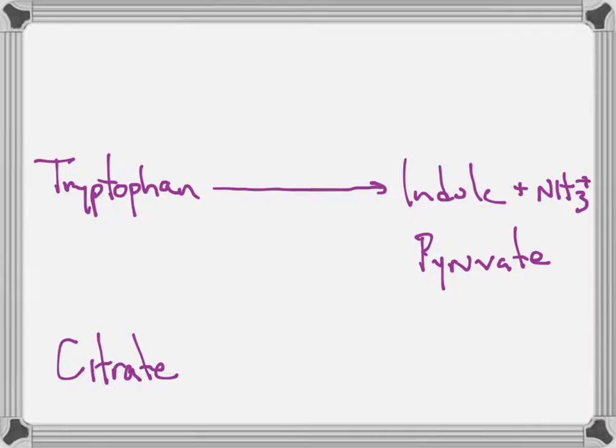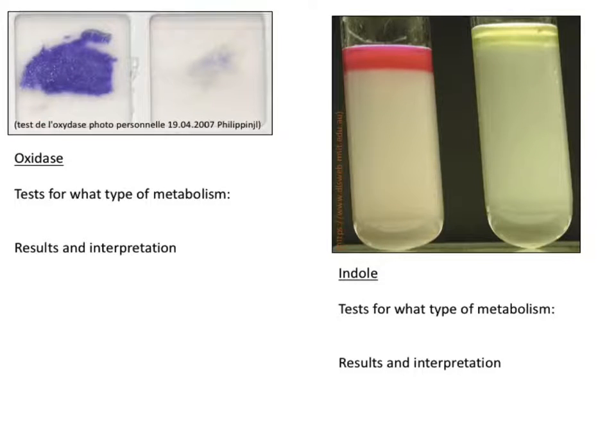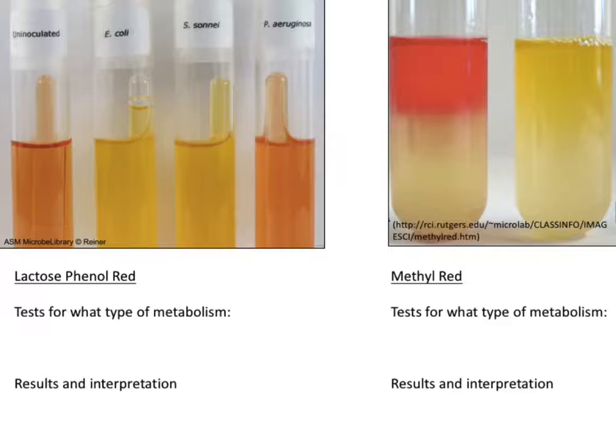Is the right tube on methyl red negative? Yes, the right tube. Since it has that yellow color, the pH is above 5. What that would indicate is that the acids produced during fermentation were unstable and have been broken down. Exactly.